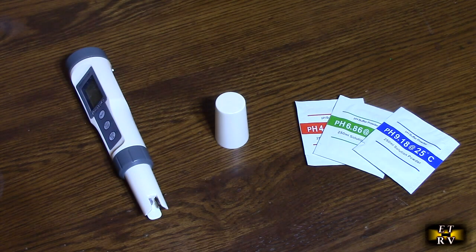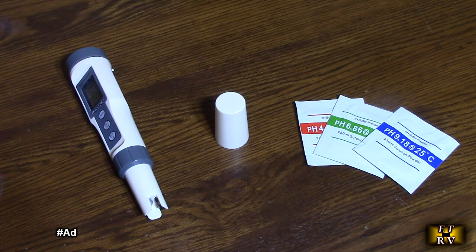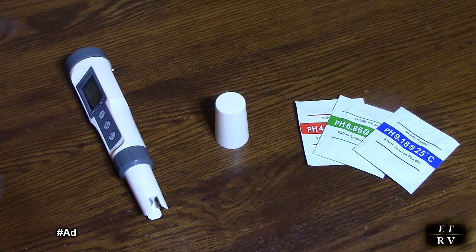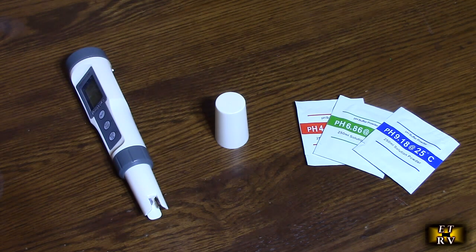Hello again, this is Robert Veach here. This is my video review of the PMO YOKO brand pH and TDS meter digital combination tester. It also has temperature, a backlit LCD display, very accurate 0.01 high accuracy, actual customer ratings, and one year warranty.